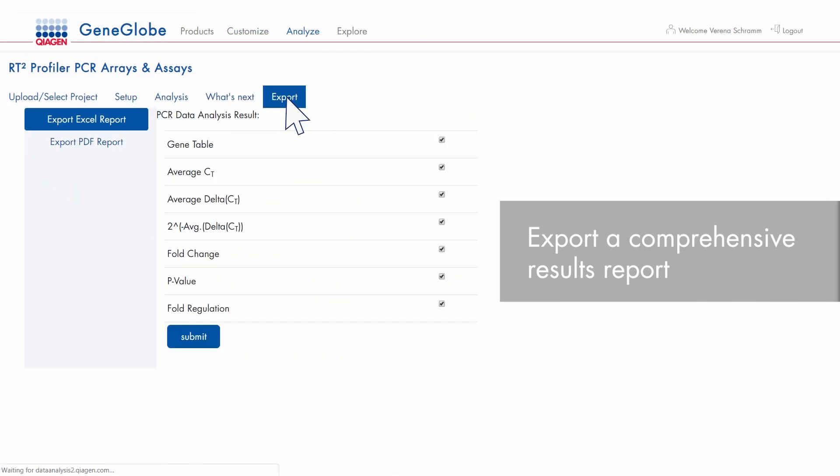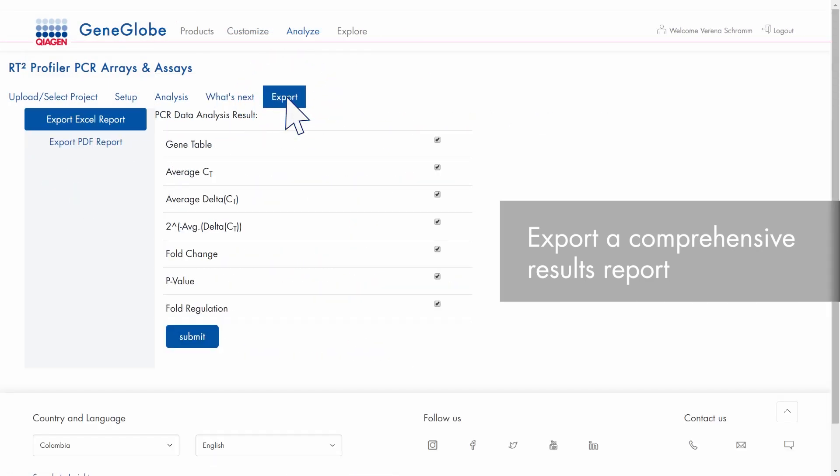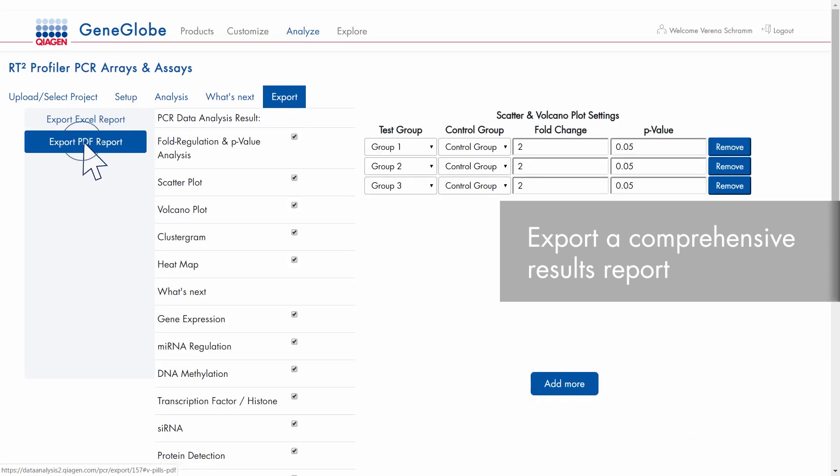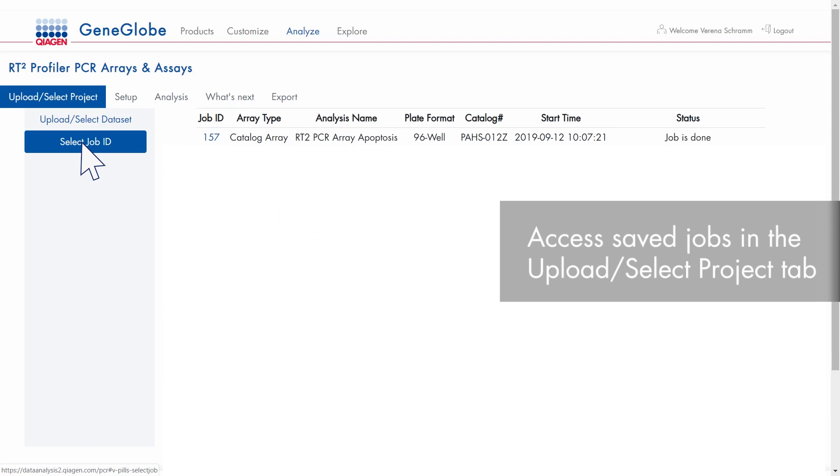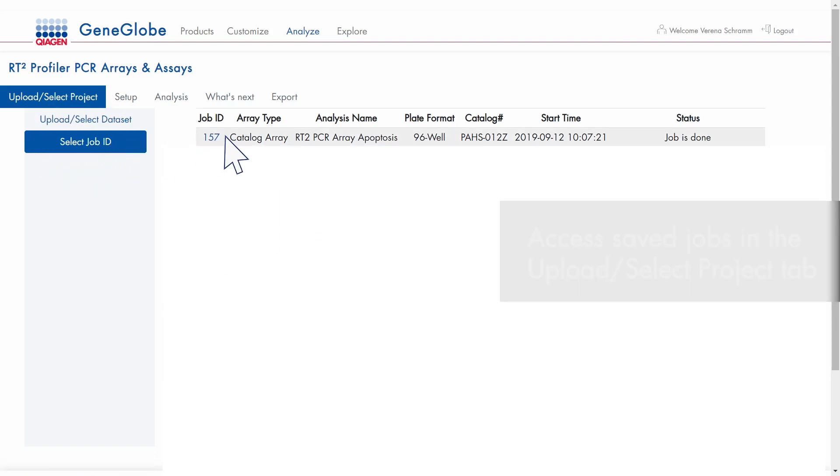When you are finished with your analysis, you can export a comprehensive results report. Your analysis jobs are saved in the Upload Select Project tab and can be re-analyzed again if needed.